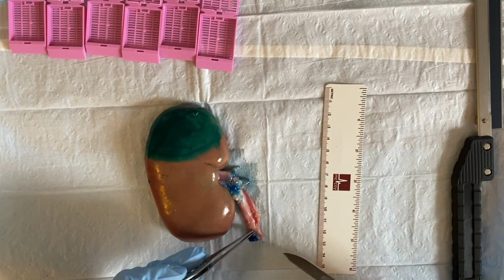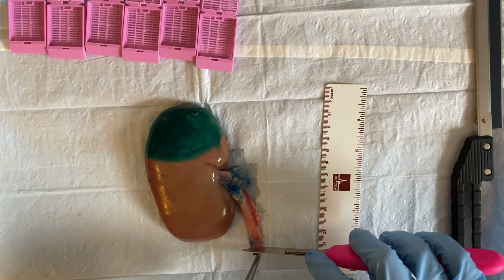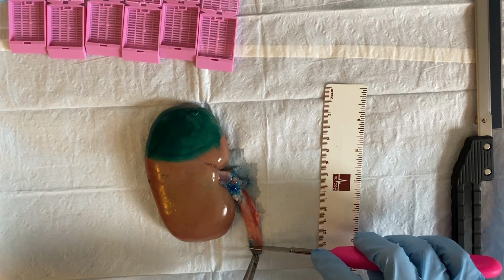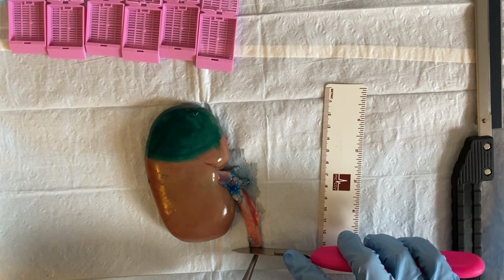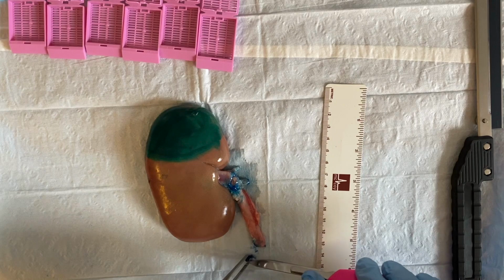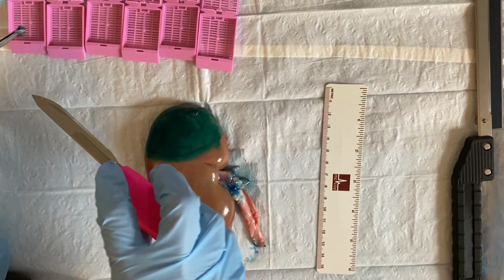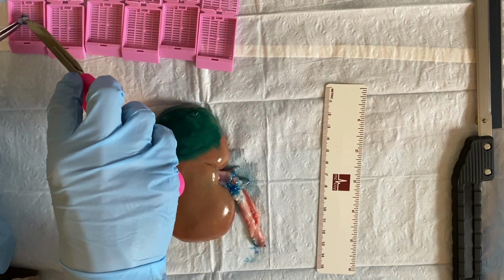I'm going to go ahead and shave my ureter. You can do this with scissors or with a scalpel. And those are submitted into the cassette en face.